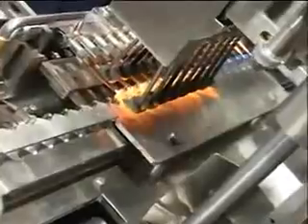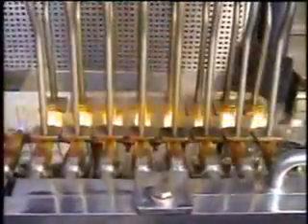After the final flame adjustment, the ampules are rotated in the flame by rotating rollers. When the glass is softened, the plunger grasps the tip of the ampule and pulls it away from the body. The tips are collected in the waste box. The burners are turned away from the service side for operator safety. Opposite the flame station is the heat extraction unit.